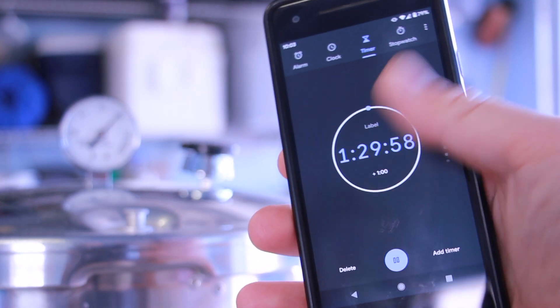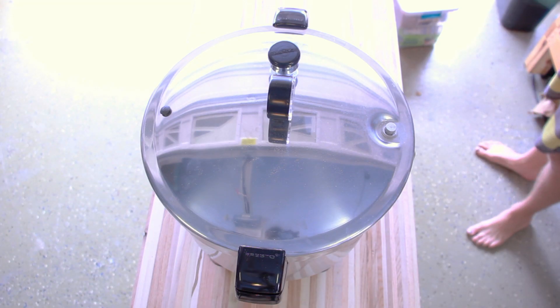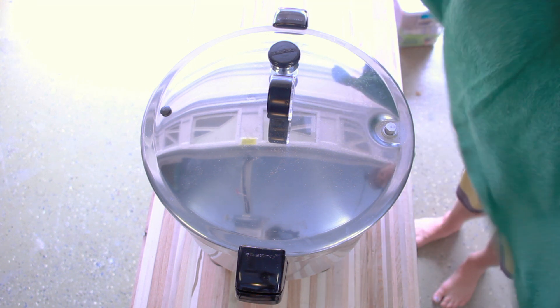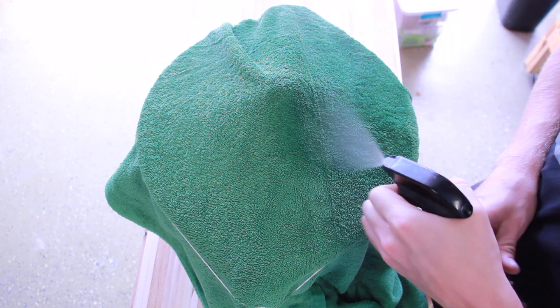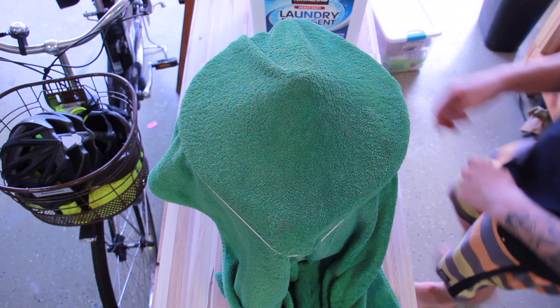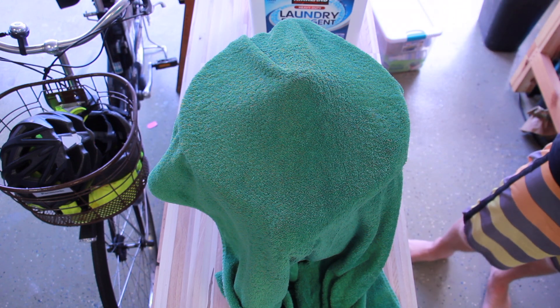After an hour and 30 minutes, you can turn off your pressure cooker and unplug it. Then I like to put a blanket over the top so that as it cools, it's not sucking contamination into the pressure cooker. I spray it with isopropyl alcohol — my theory is that it will kill anything that's already in my clean cloth. I allowed the pressure cooker to cool to ambient before I pulled my towel off the top and started removing jars from the pressure cooker.